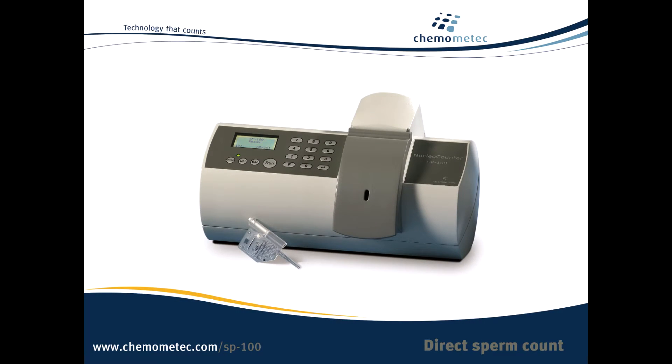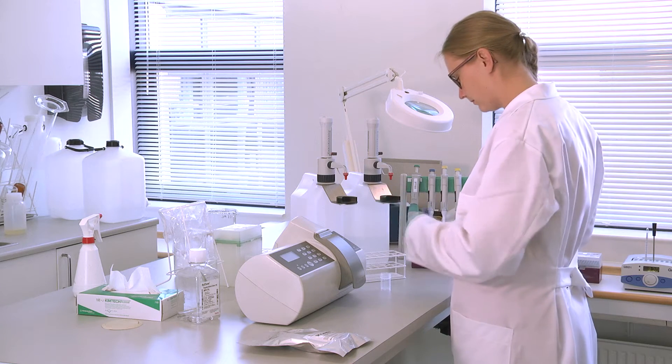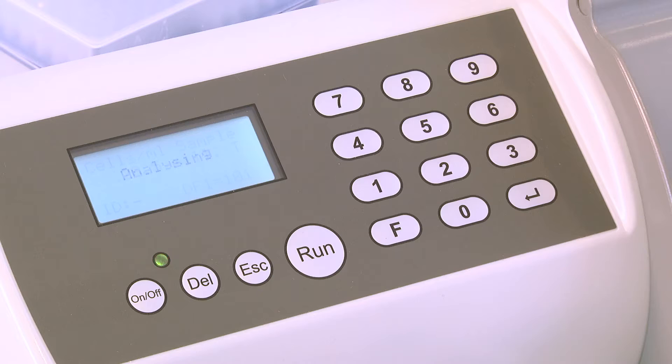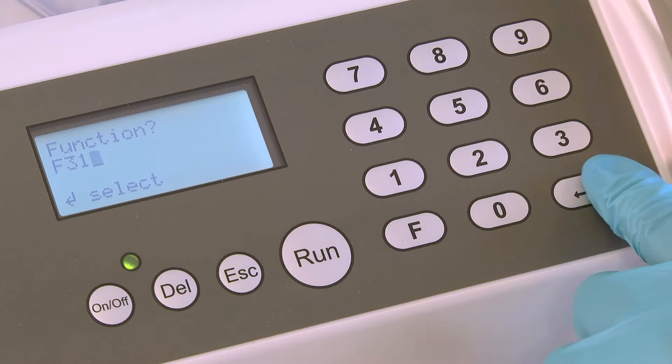The Nuclear Counter SP100 is the world's easiest sperm cell counter, with outstanding repeatability. It provides the total sperm cell count in 30 seconds and, with a second cassette, measures percent viability as well.